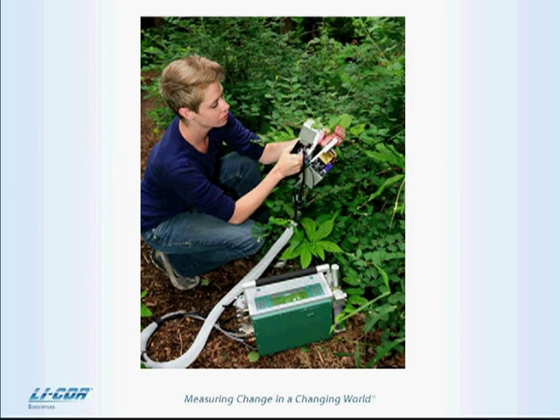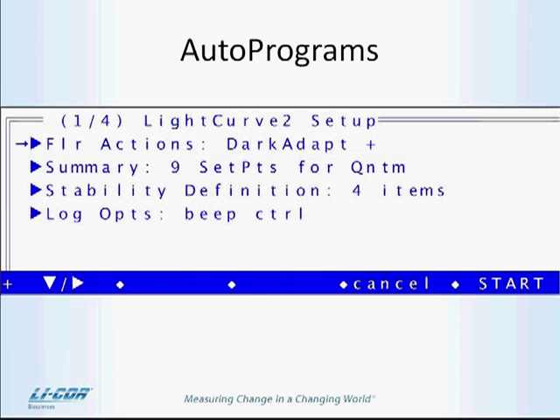Of course, you have to be careful with turning controls off because you can do bad things. Plants don't like it when you reduce their CO2 or light level. Their photosynthesis rates tend to react to that. So, okay, let's go on to the next big change, and the next big change is going to be in the auto program structure.